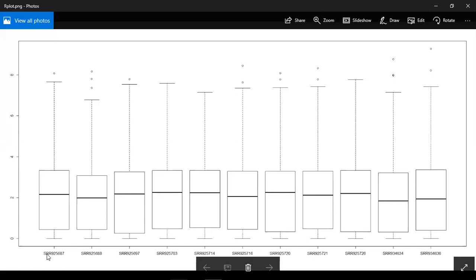So, we have 11 different breast cancer cell lines. Most of their expression is similar, but there are some differences. In each of the samples, we have some extremely highly expressed genes for each of the breast cancer cell lines. Those would be some conclusions in brief, but there is another conclusion we can see from the box plots, from the Q1, Q3, and the median: our data is now continuous.